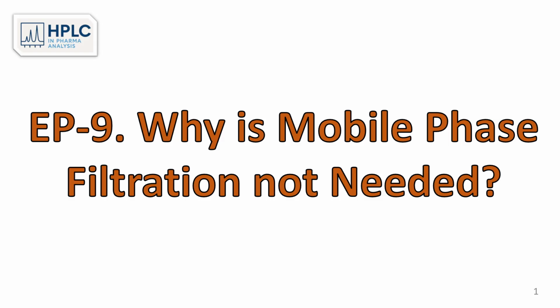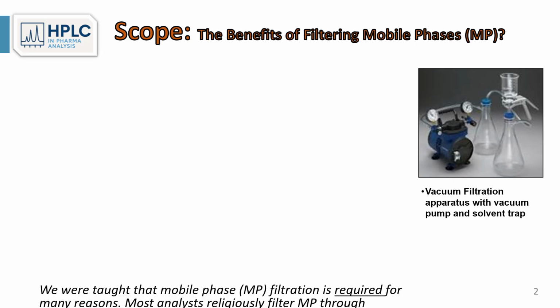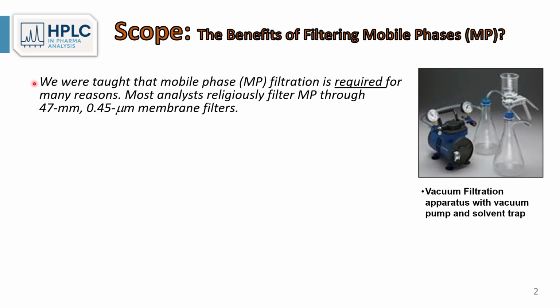Why is HPLC mobile phase filtration not needed? Scope: the benefits of filtering mobile phases. We were all taught from the early days that mobile phase filtration is absolutely required for many reasons.